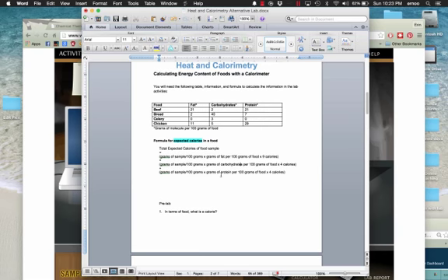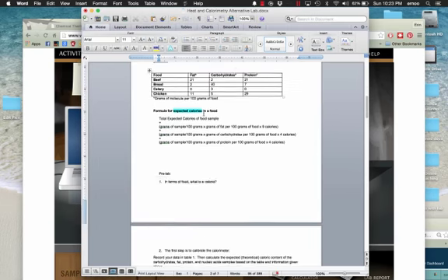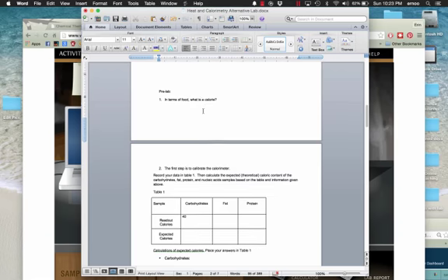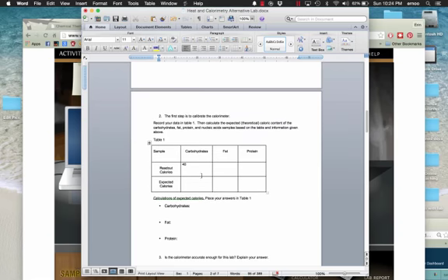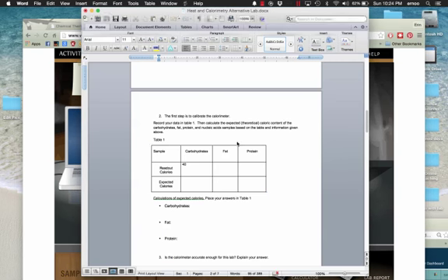So when you are calibrating, if you have a readout, and I can do a test for you, but in your sample, your expected or calculated calories, say we have a 10-gram sample, and we know that carbohydrates have 4 calories per gram of carbohydrate, you should expect 40.